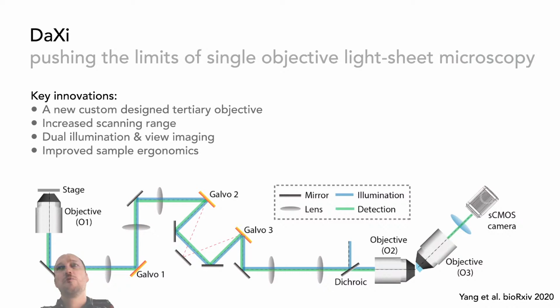And as you can see, we have a number of optical systems laid up here together in both an illumination and detection path. And I will go through a little bit the details of that as we go forward.